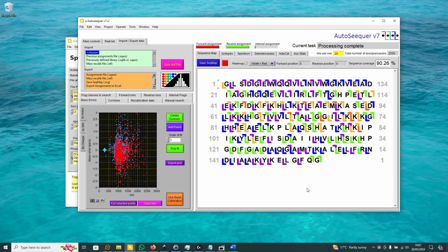We chose this output format because it will make it easy to plug in to downstream bioinformatics pipelines. Most programming languages, such as Python or R, already include libraries to make it easy to load and process data in SQLite format. But you can also export all the assignments to Excel.